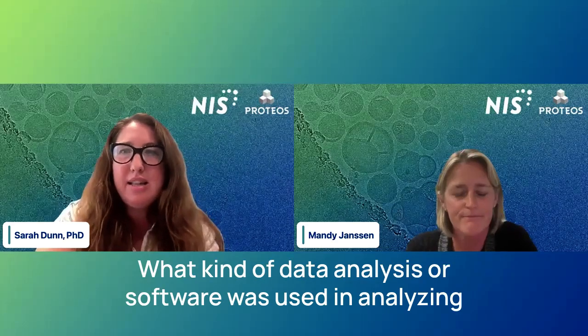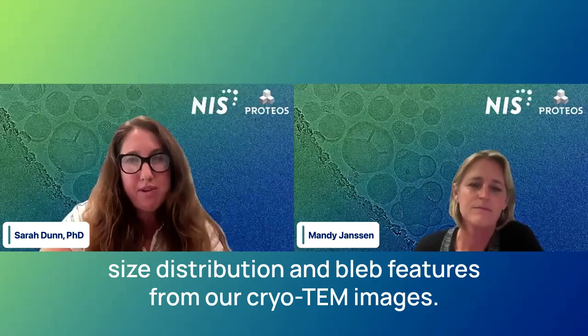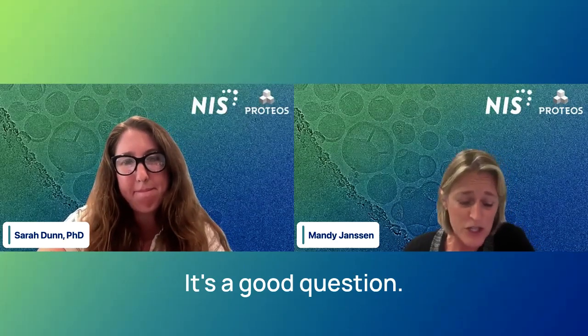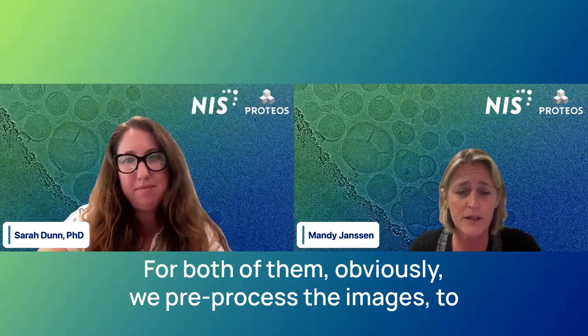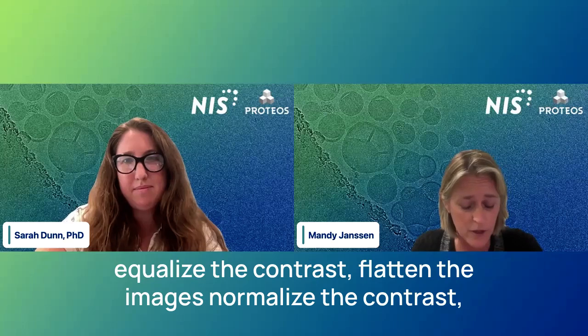Okay. Next question. What kind of data analysis or software was used in analyzing size distribution and bleb features from our cryo-TEM images? It's a good question. Both require a different type of tool. For both of them, obviously, we pre-process the images to equalize the contrast, flatten the images, and normalize the contrast.